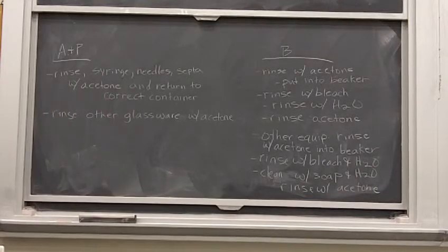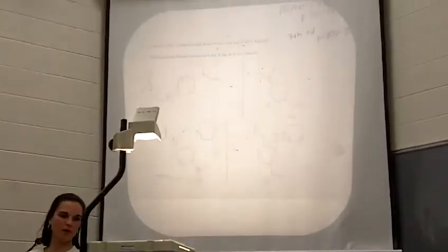Okay, so let's look at now, first the report form that you're going to turn in, and then I have some information for you to hopefully help out with your pre-lab too. So your report form, there's 2 pages to it. First page, you fill out this top section, put the structure of what you made. You're going to, first of all, evaluate the IR spectrum. So follow these instructions and answer these questions for IR spectrum. And then you will evaluate your product with the NMR spectrum and make sure you answer these questions.